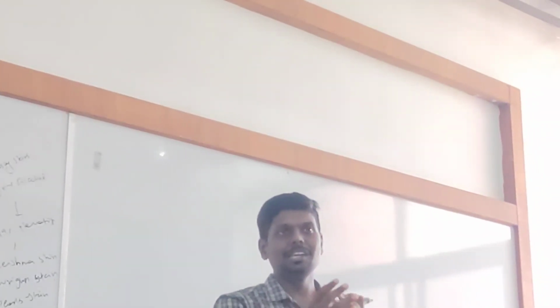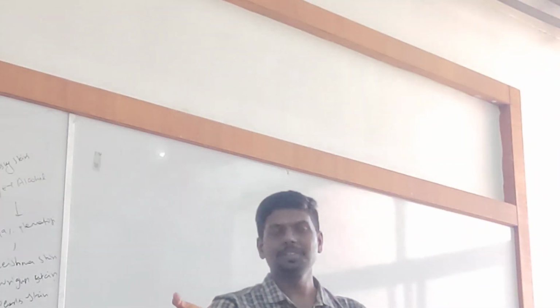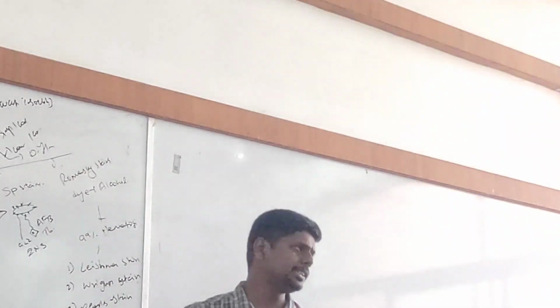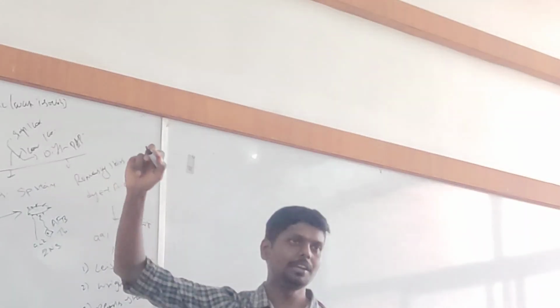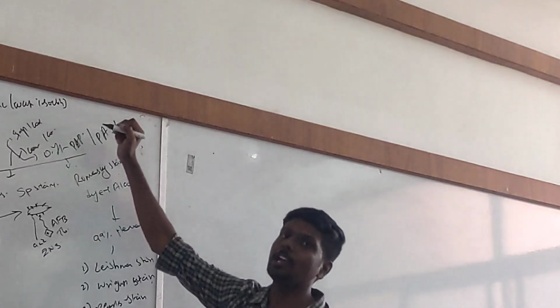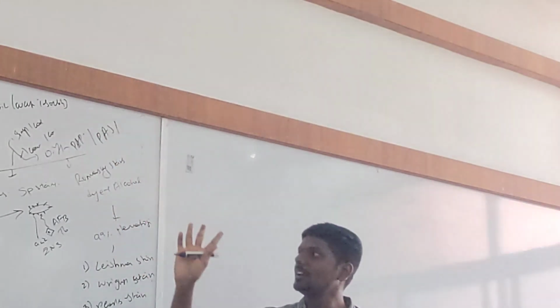Differential stains means these stains will color various cells in various colors based on the cell property. They are called differential stains. Examples of differential stain: Pap stain, PAS stain, periodic acid Schiff stain.